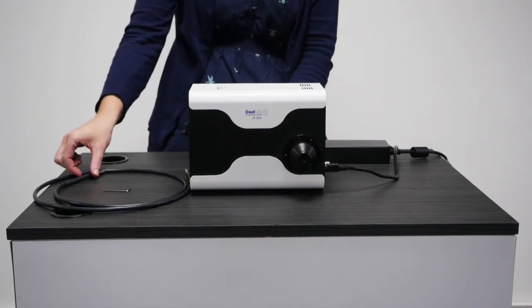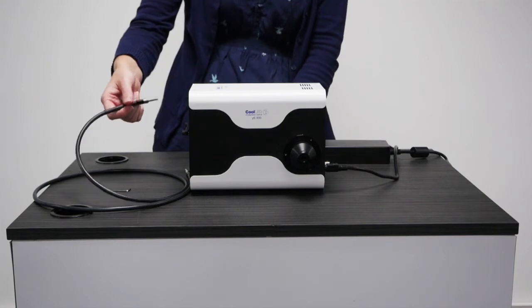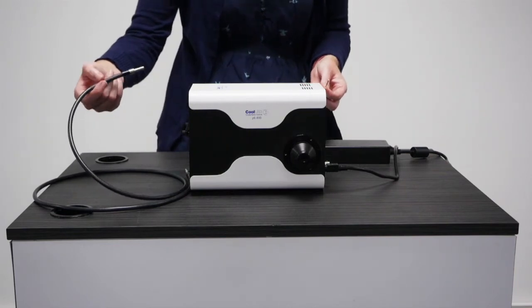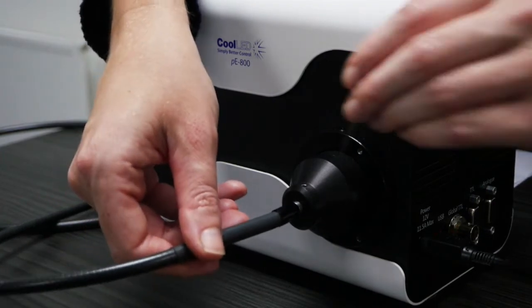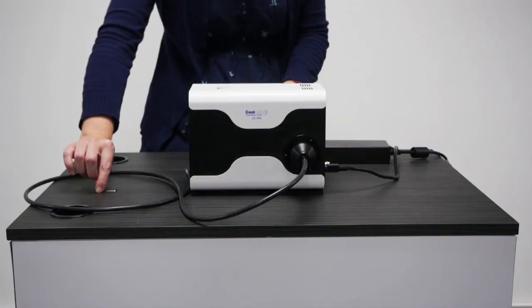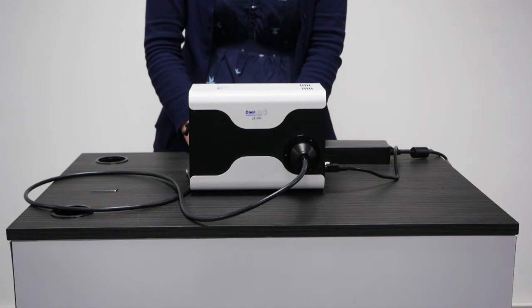Light is delivered to the microscope via a 3mm liquid light guide. If you already have your own or you have ordered a new one with your pE-800, then insert the end of the liquid light guide into the light source and secure using the hex key provided. The light source is now ready to be connected to the microscope.